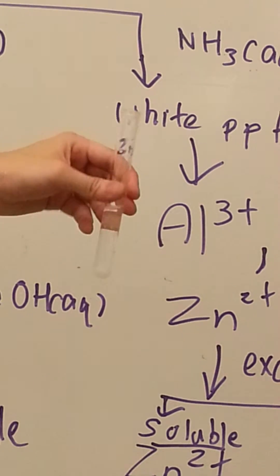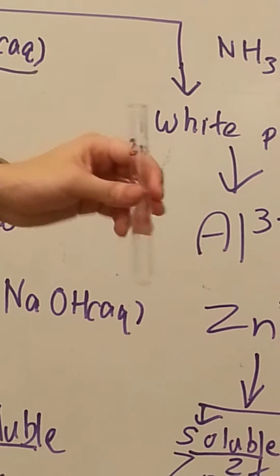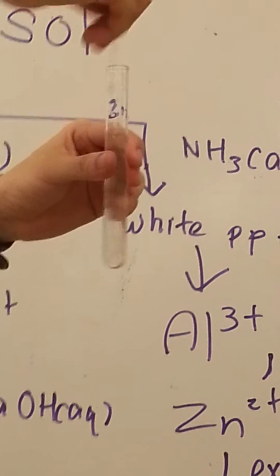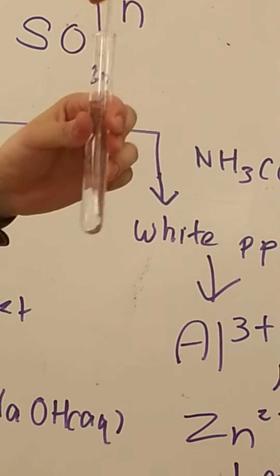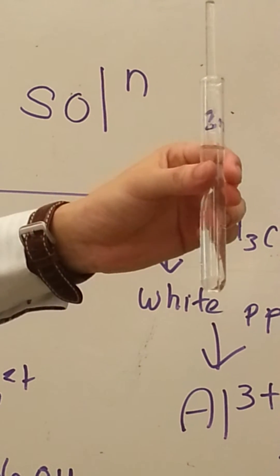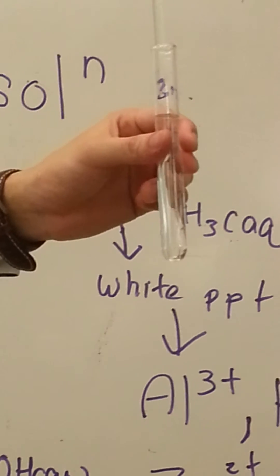Add at least half. We can see it's dissolving. If it's really hard to dissolve, we use a glass rod to stir. You can see — when you stir, it gives a clear solution, which means zinc is soluble in excess ammonia.